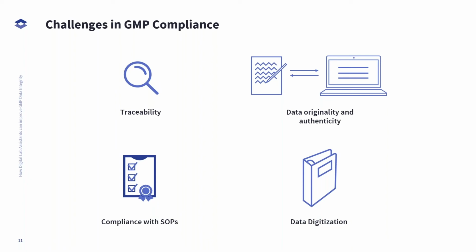And what this included was the inspector literally walked into the lab, requested that an analyst log into the computer system, and along with the established SOP, walk through the steps required to assure data integrity for data generated as a result of laboratory testing.